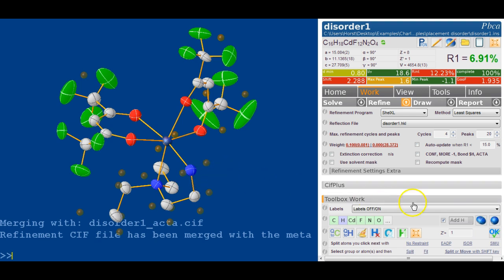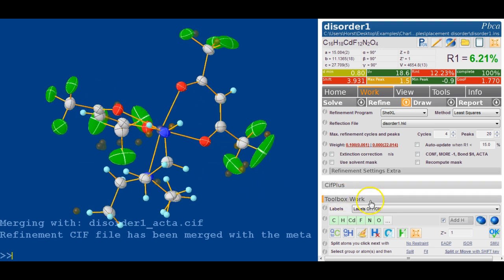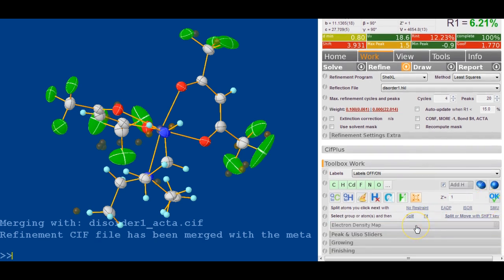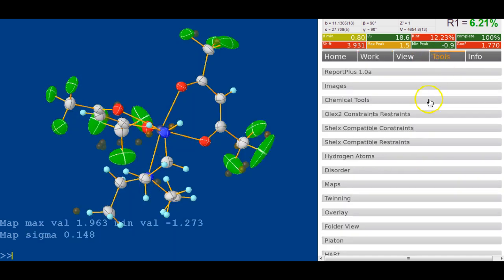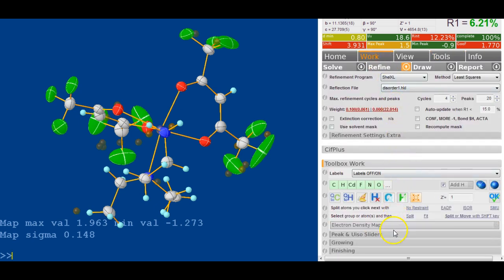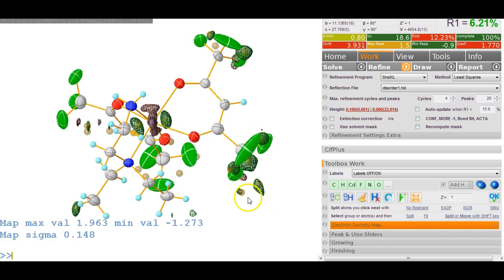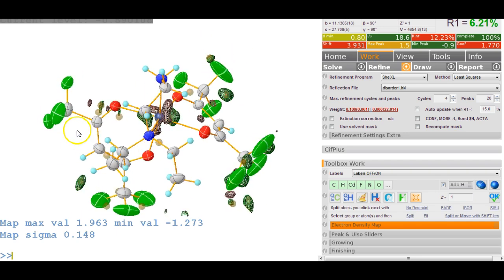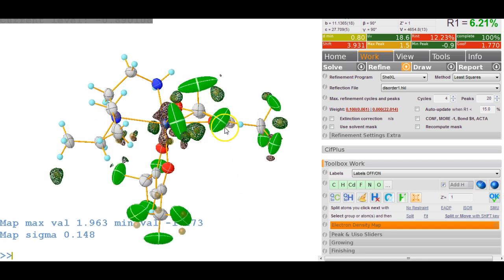Let's add hydrogens geometrically to the structure. We check the electron density map - switching over to Tools and Maps, I wanted the wire view rather than contour and plane. With F2 for a white background, that looks fairly good. There's no clear wrong atom type assignment, but we've got this disorder, and I think it's strongest in this group here, which the ellipsoids and the elliptics tell us.